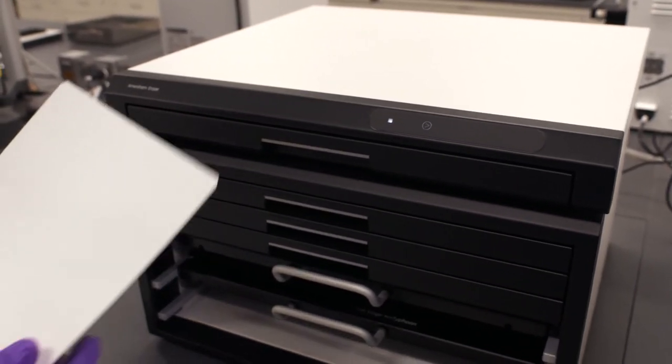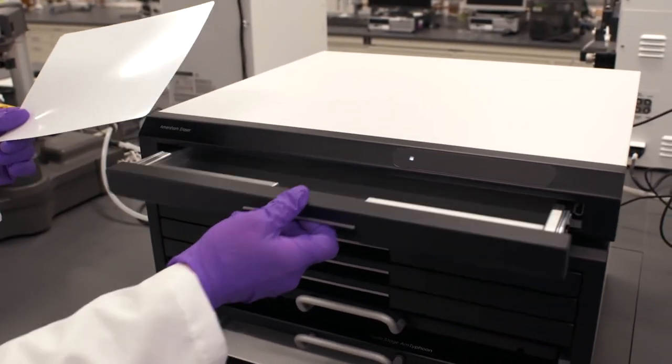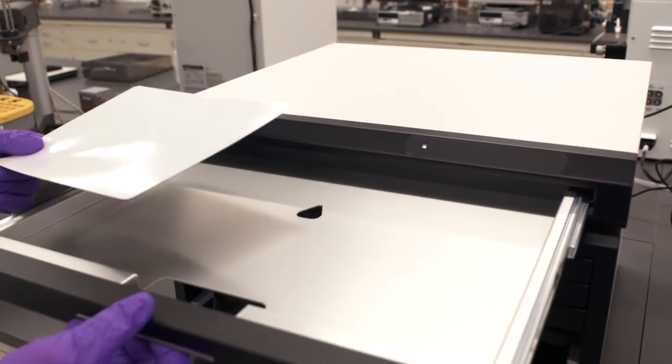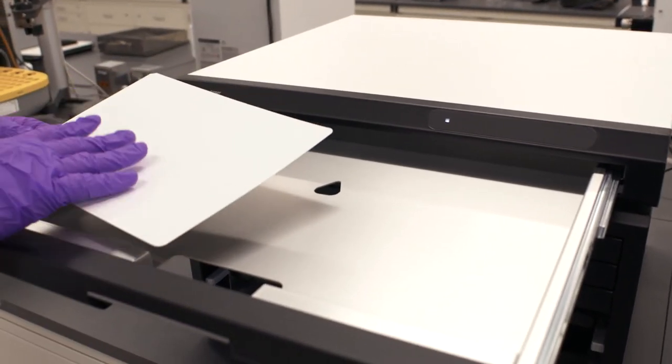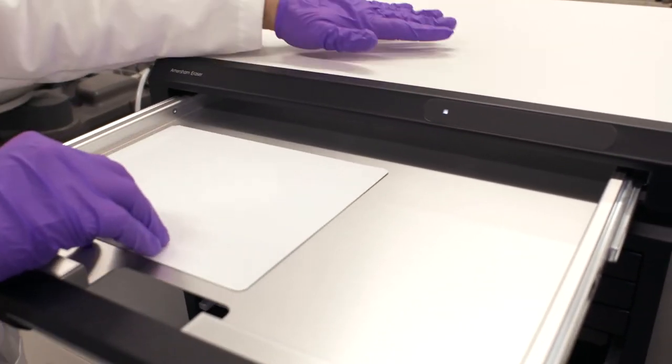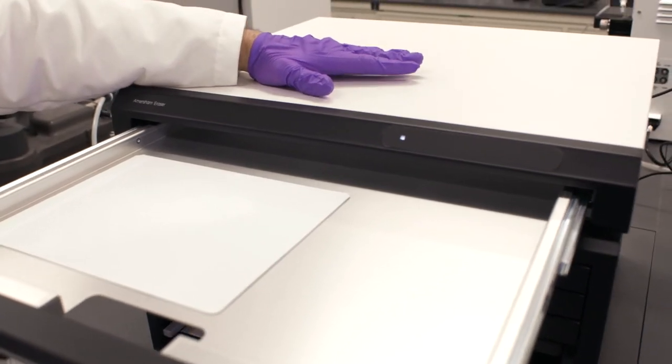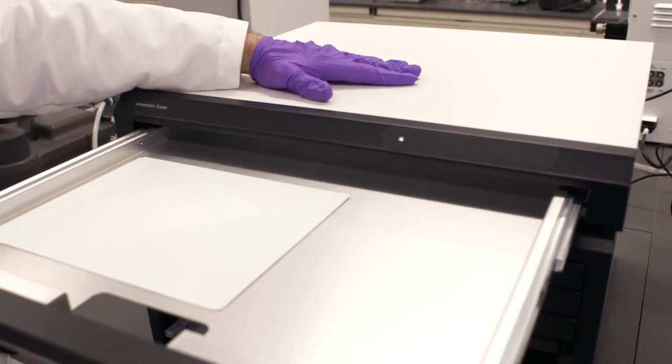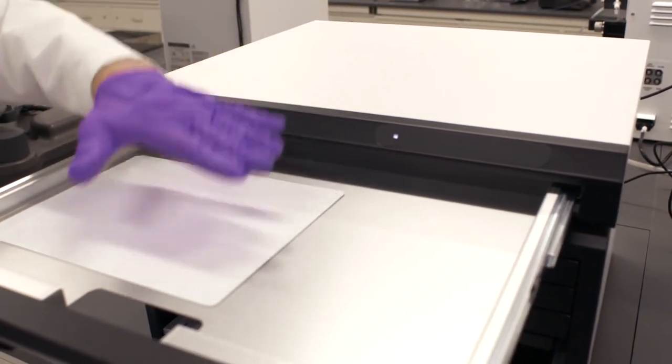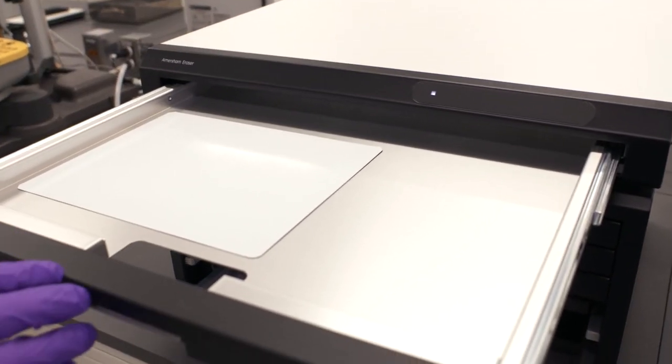When you place the screen into the eraser it's very important we have the white or blue surface uppermost. The reason for that is the white LEDs are built into the top of the eraser and they're going to shine downwards onto our screen here.